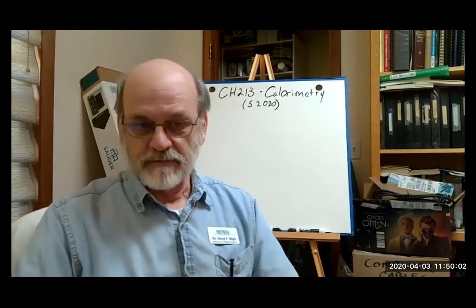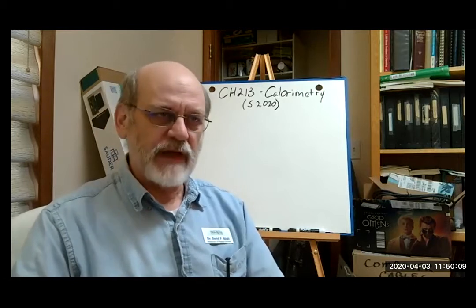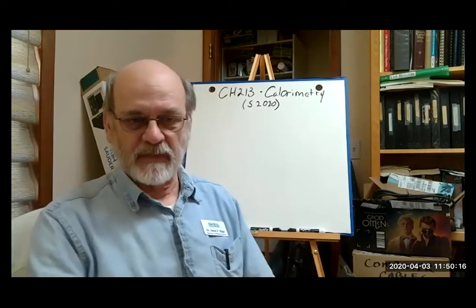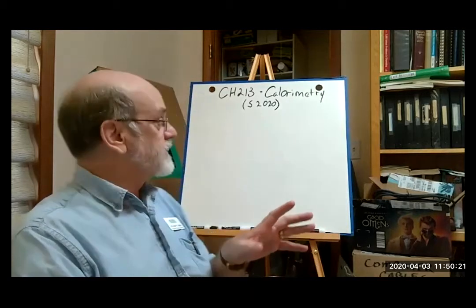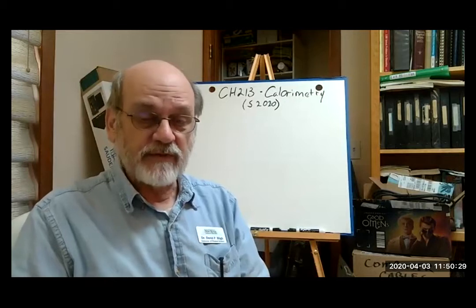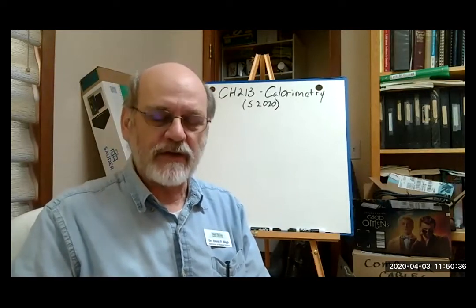You've got to be able to think the experiment, which is something that Albert Einstein used to do constantly. He was famous for thought experiments. But in this case, I'm going to describe the experiment, which is calorimetry, and the theory behind it, the types of calculations that you'll need to do, and then I'm going to give you the data that you would need to do those calculations.